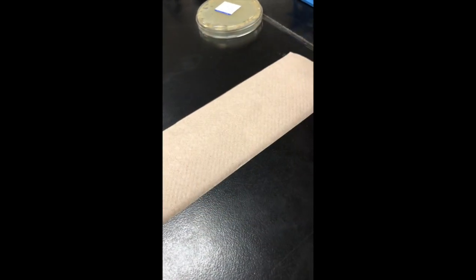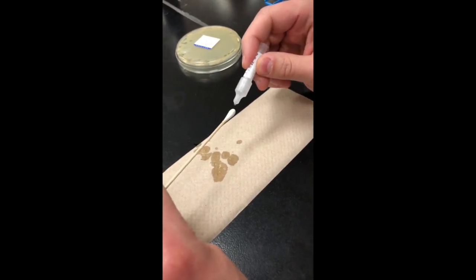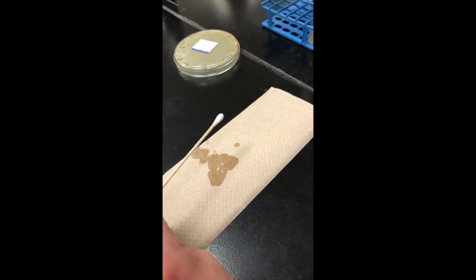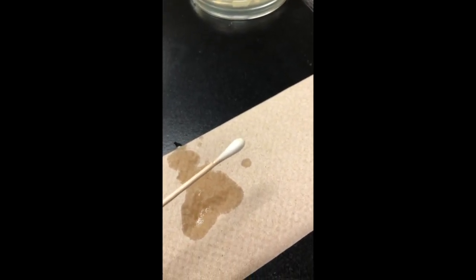Mm-hmm. Let me use my dominant hand. Oh. Does that ever happen? Yes. We had a breakthrough that I mostly missed. There we go. Okay, so we've added our oxidase reagent. And do you see any blue?